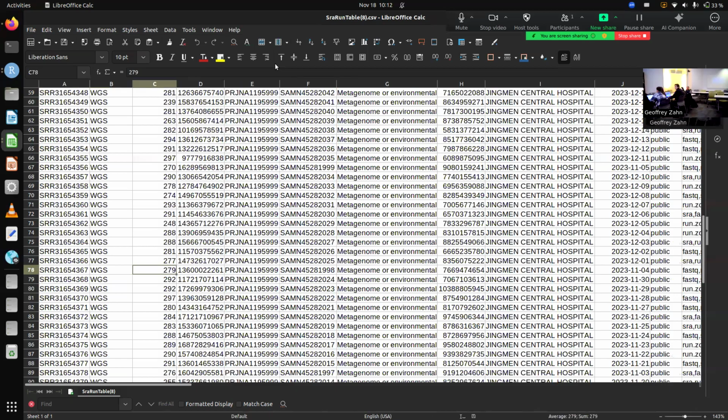So remember, by far, our only bottleneck in terms of time is going to be that assembly step. And that one we're submitting as 10 separate jobs, so they all run at more or less the same time. So it's okay.